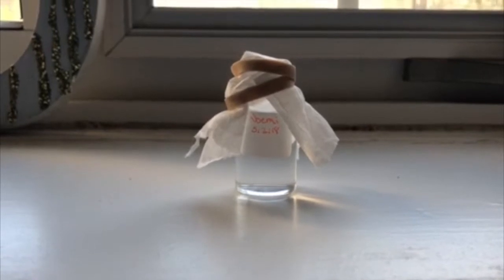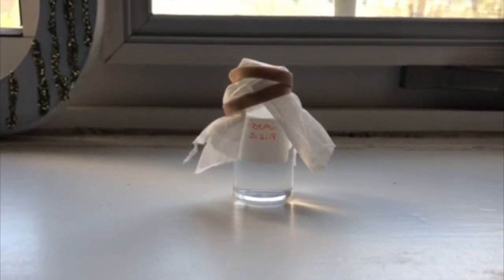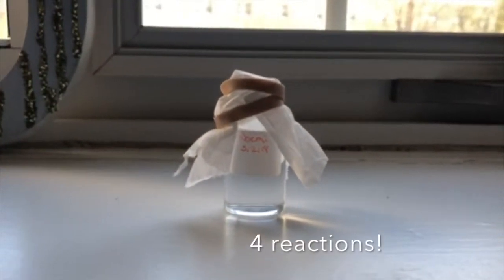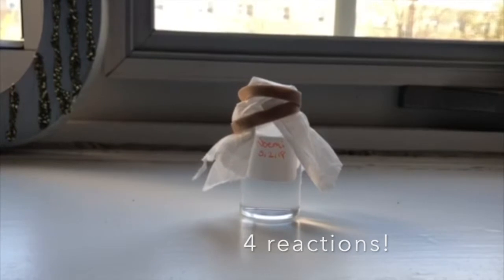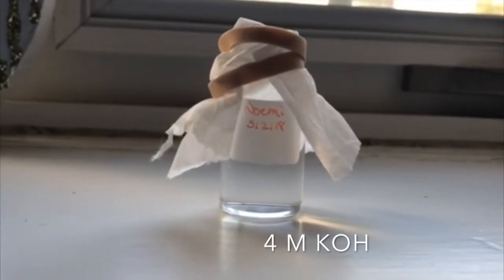For this lab, our goal is to create alum crystals from a saturated alum solution. We created the saturated alum solution by completing 4 different reactions. For the first reaction, we dissolved 1 gram of aluminum foil in 4 molar potassium hydroxide.